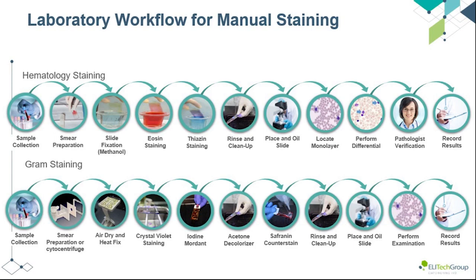Once that counterstain is done, you rinse off the slide, look at it under an oil immersion lens, perform the examination, and get those results sent out to the clinician. Again, how long you leave in the crystal violet and the exact steps for the iodine, mordant, as well as acetone and safranin, those all vary depending on the reagents used and your lab's specific workflow.